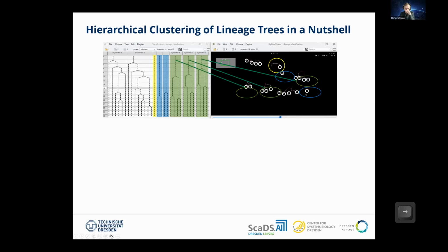And then there are the cells in the green cell. So they start with one cell, then they have one division, and then the two dividing cells divide into two other cells. And that's also reflected in the track scheme. I call it here symmetric, 1, 2, and 3, because the division pattern is quite symmetric.